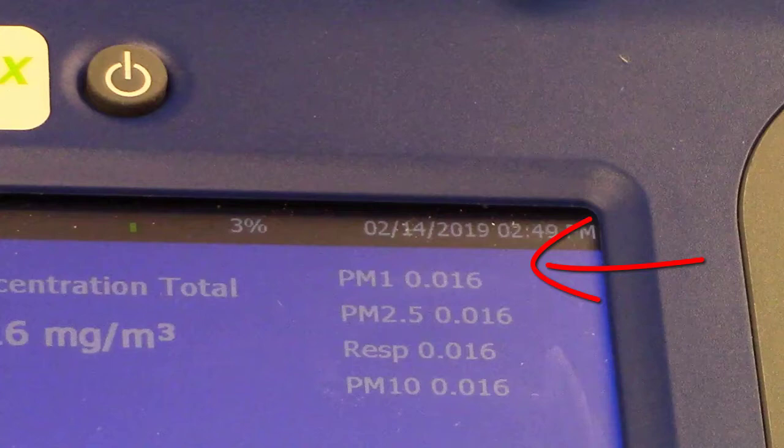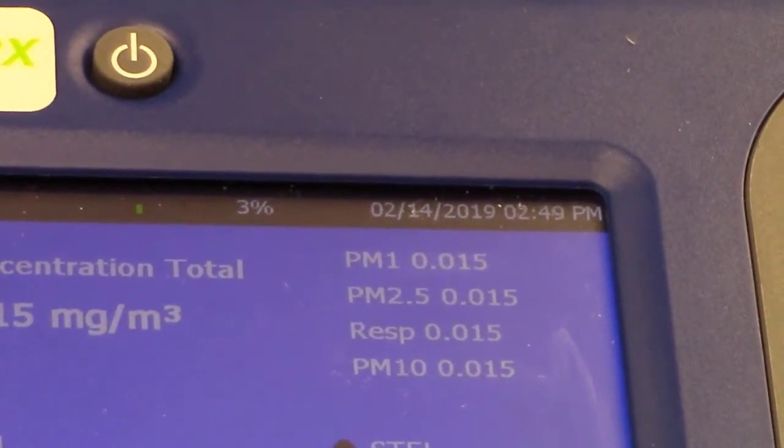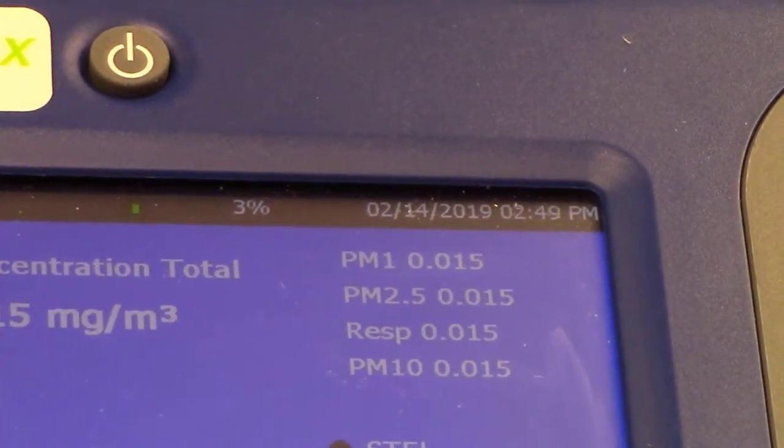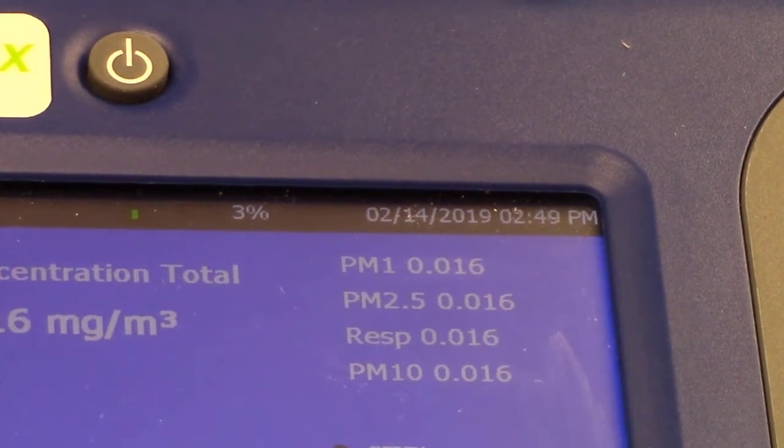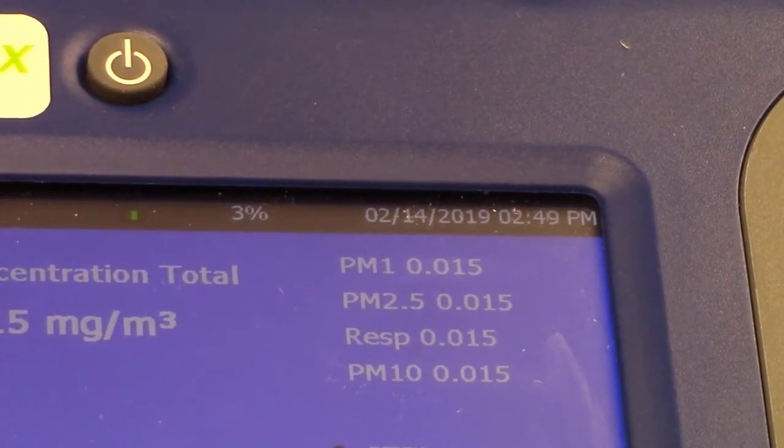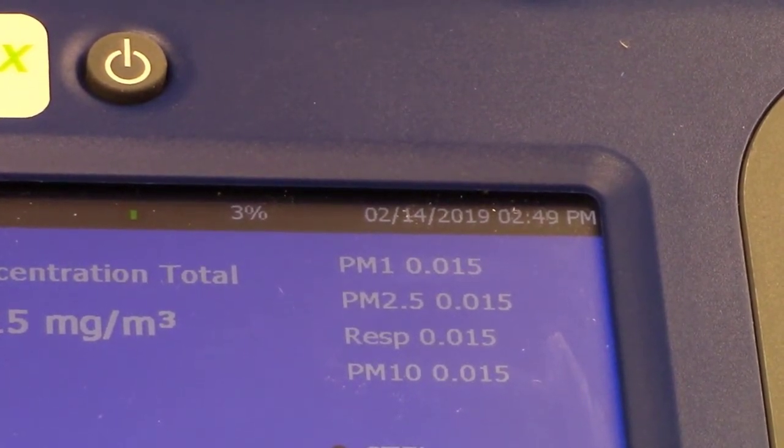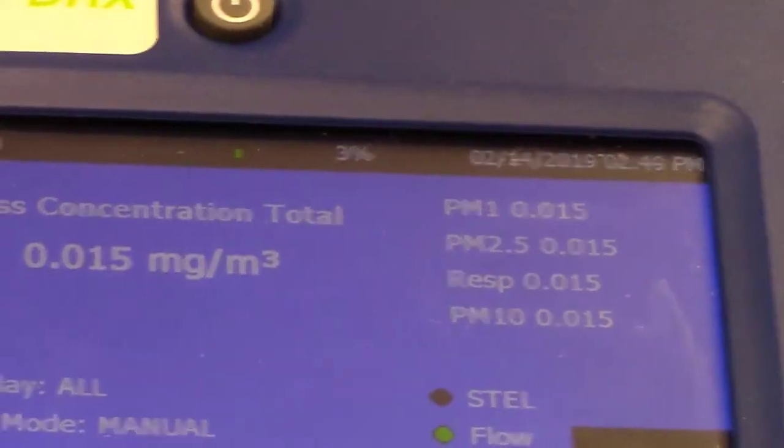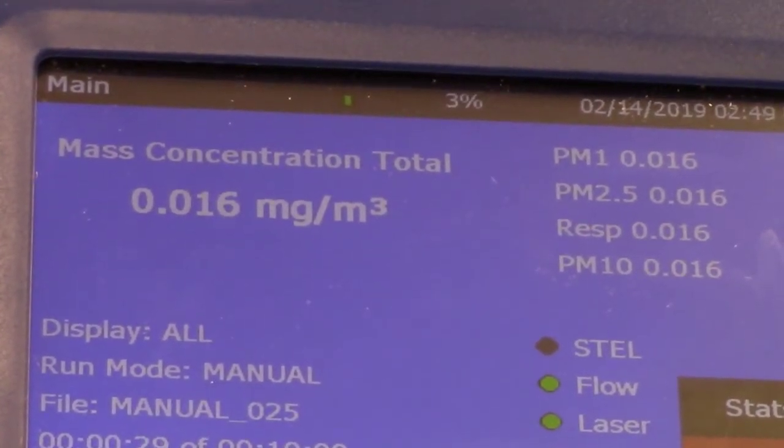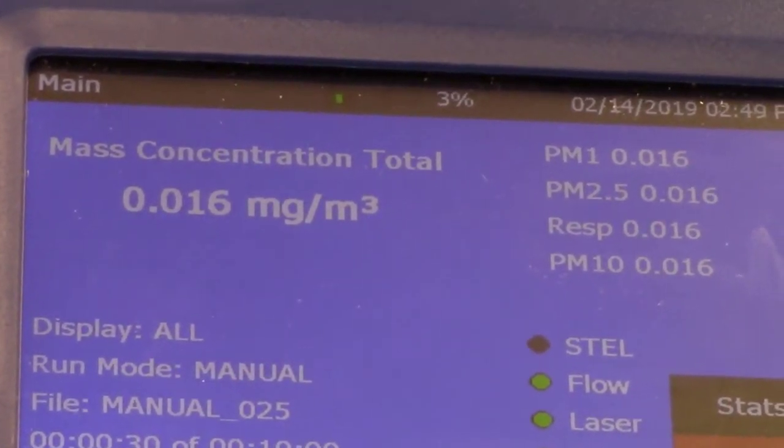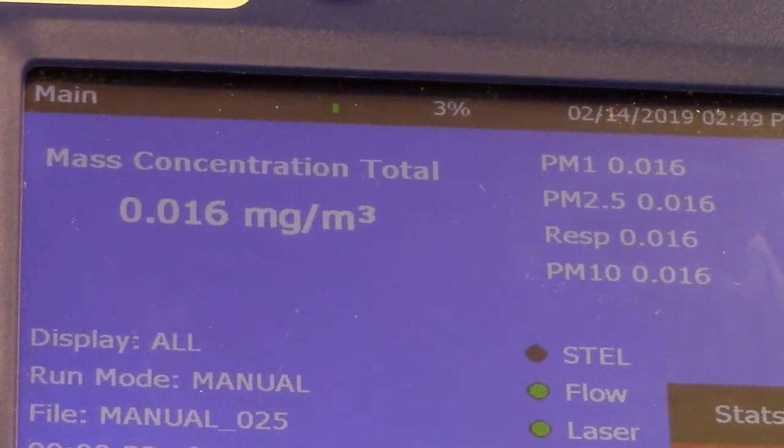I will be running my baseline again for five minutes. So the instrument will be running. And for the sake of time, I will be fast forwarding and showing you measurements just before I pour the cat litter.